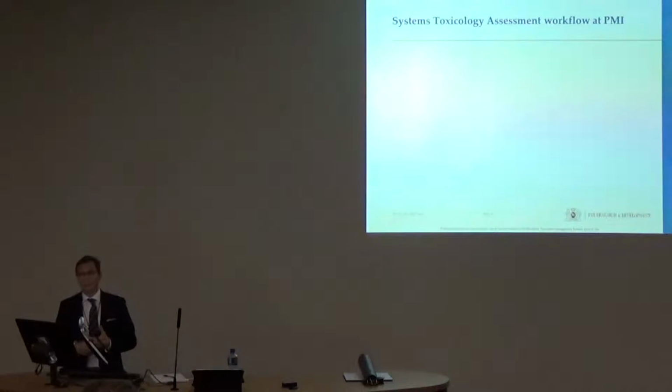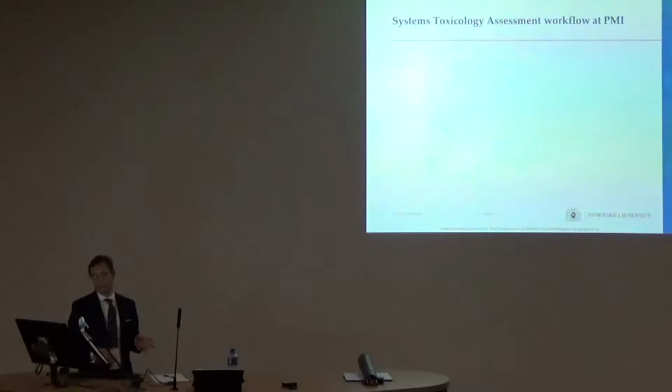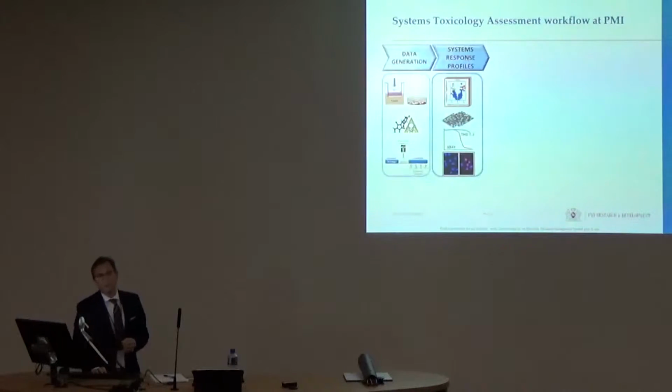And some of the things that we've done is to develop a workflow for systems biology-based toxicity testing, which is very much in line with this idea of toxicity testing in the 21st century. So I would like to share with you what we do and some of the lessons that we learned and some of the challenges. So this workflow is a 5-step process.